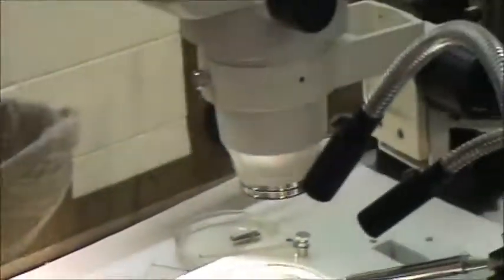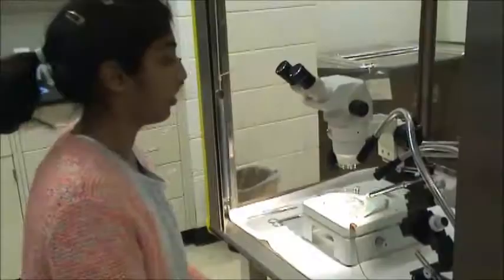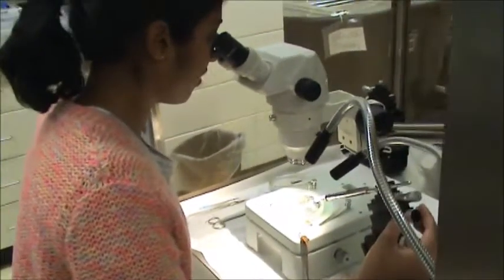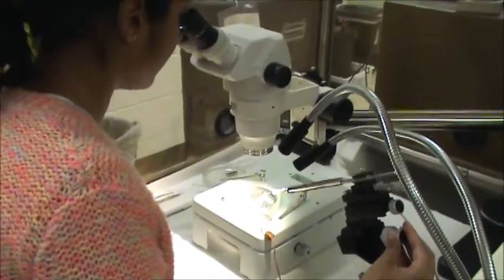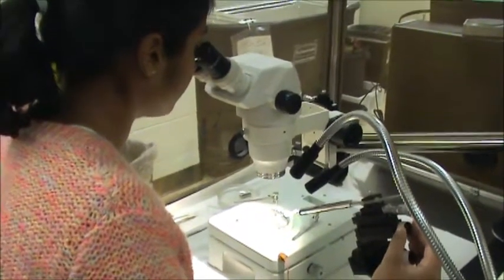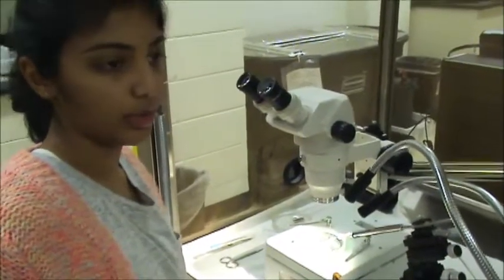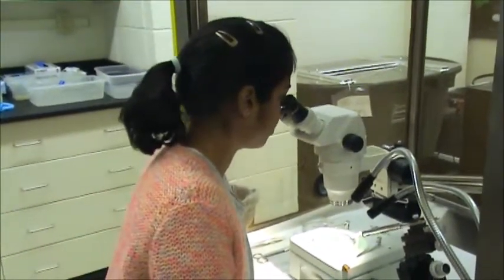And now we're going to pull it out, and we're going to do it a couple more times just to get multiple readings. So after you got the first one, you're going to want to move your electrode over just a hair so you can get another reading on another muscle fiber, and you're going to see a dimple just like before. And so after you got your 3 readings, you can average it to find the potential.